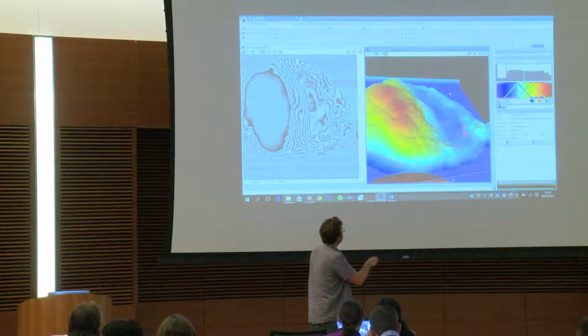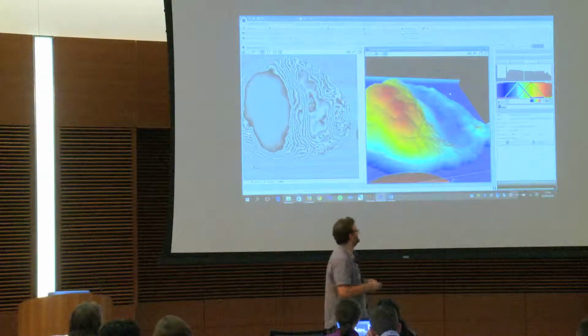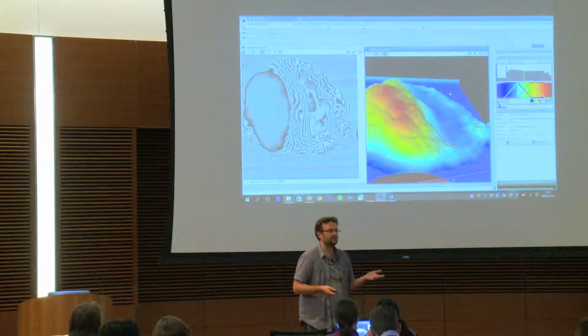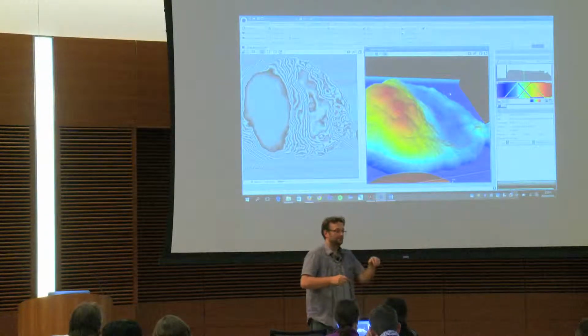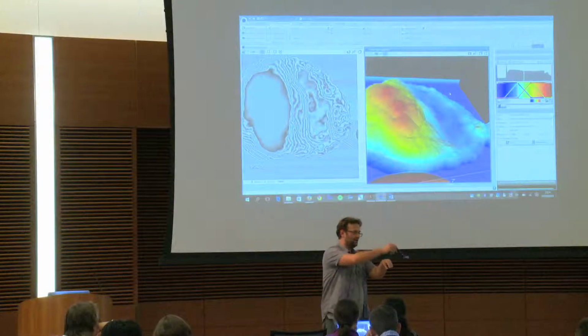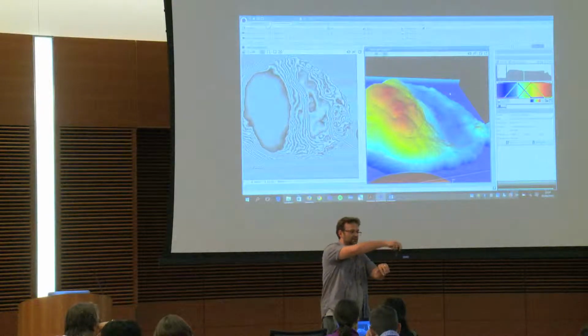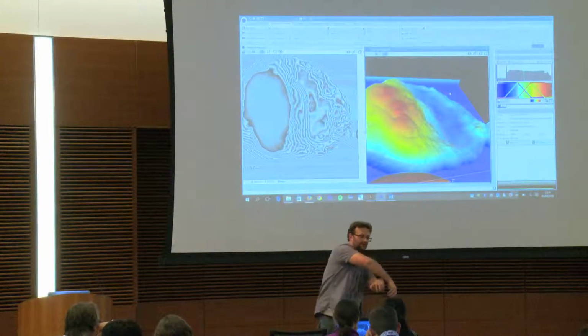And the slope that is here, for instance, that is within the sample, it's completely straight, okay? Meaning that, well, it's not natural. And you know why we have this? It's because, remember, the aperture is like that. So you put your sample here, and then you have your thing like that, and the probe is touching the sample here. Because the probe cannot be like that, because it will go into the sample.